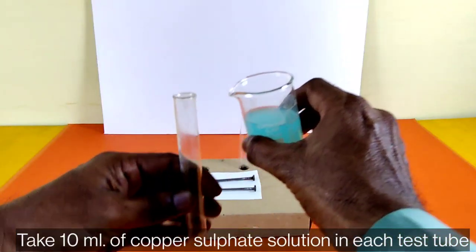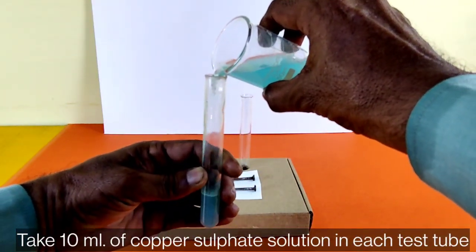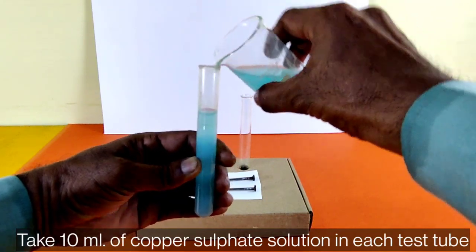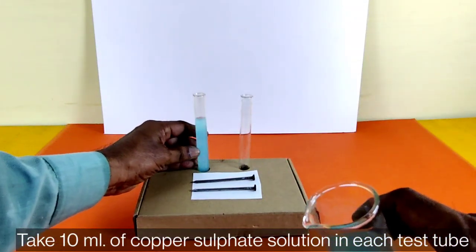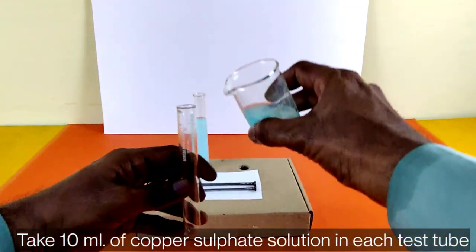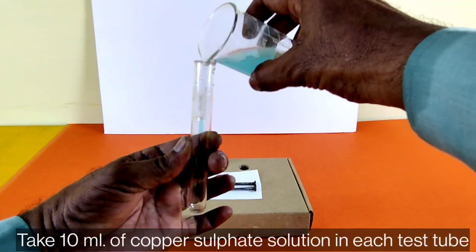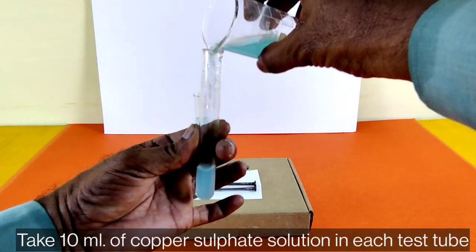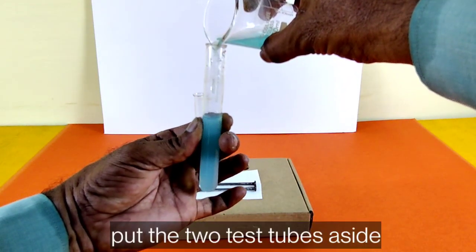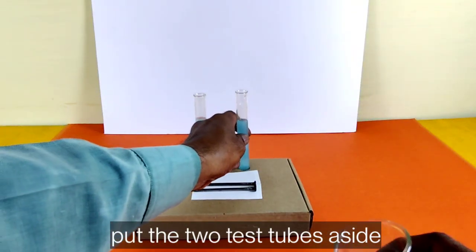Take 10 ml of copper sulfate solution in each test tube and put the two test tubes aside.